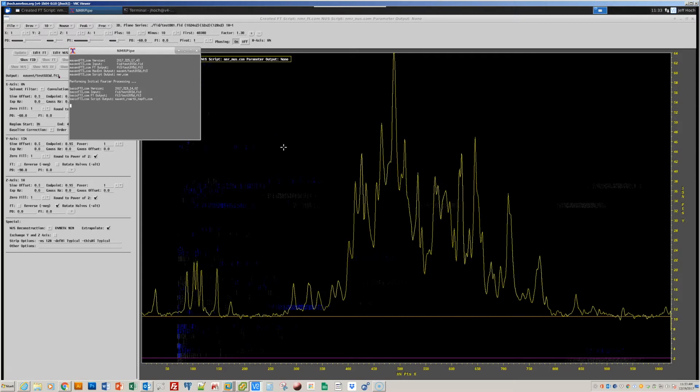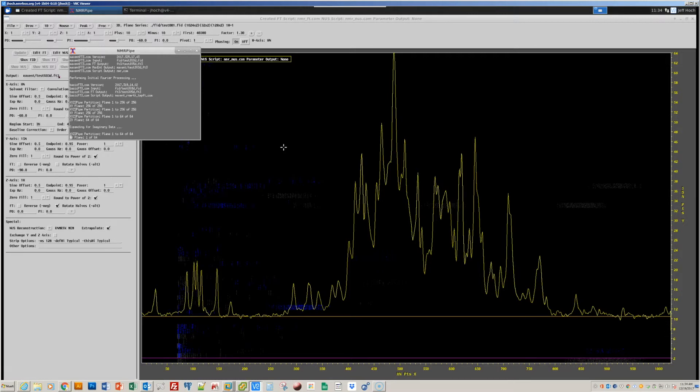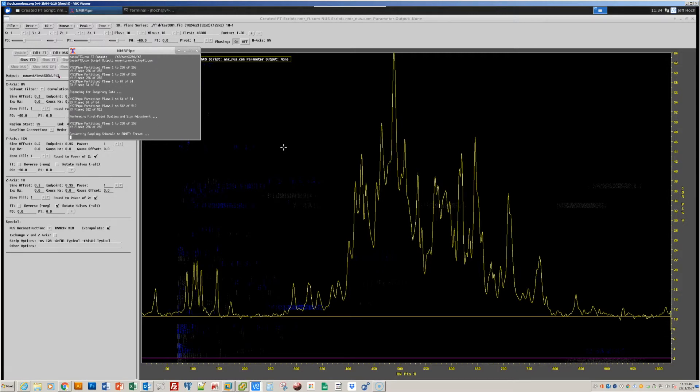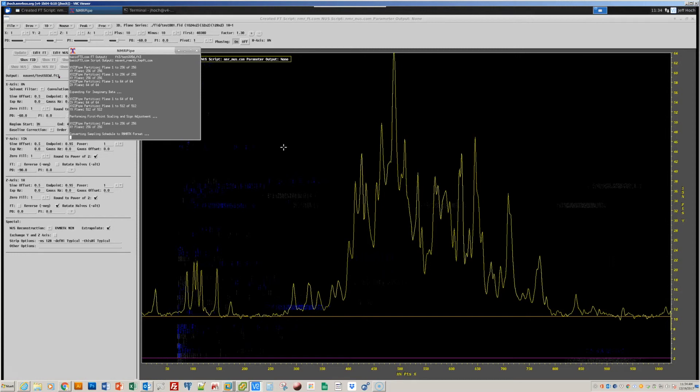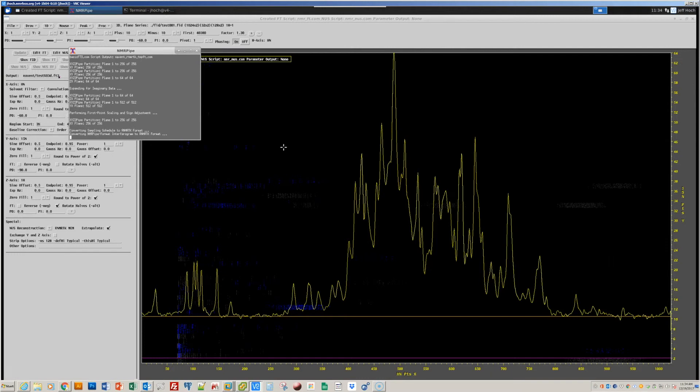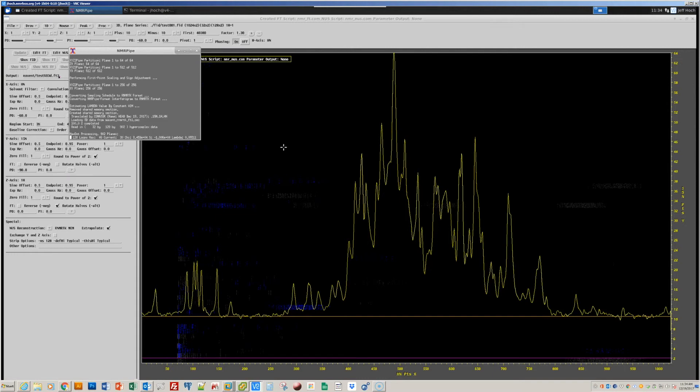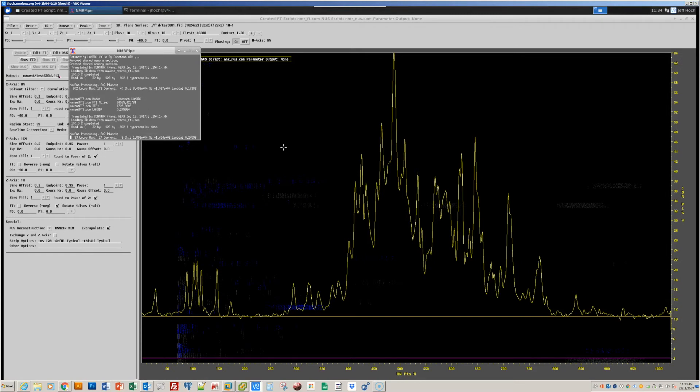And now, the maxent processing will carry through. The maximum entropy processing happens in two stages. The first stage is a maximum entropy reconstruction, with the intent of optimizing the parameters that we need for a final maximum entropy reconstruction. So, as an initial step, the NMR pipe format data is being converted into a format that can be used by the Roland NMR toolkit. And now, the first round of maximum entropy processing is occurring. And this will enable us to determine the lambda parameter, which describes the balance between minimizing the chi-square difference between the maximum entropy reconstruction and the original data, and maximizing the entropy of the corresponding reconstruction.